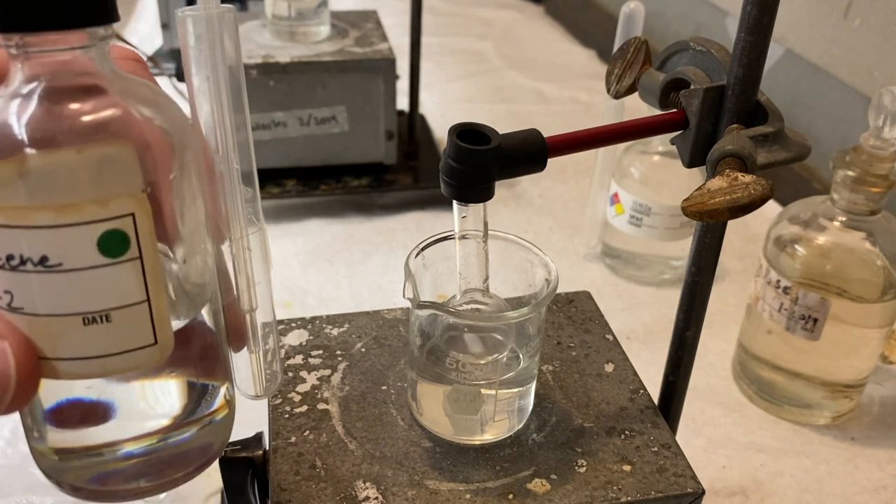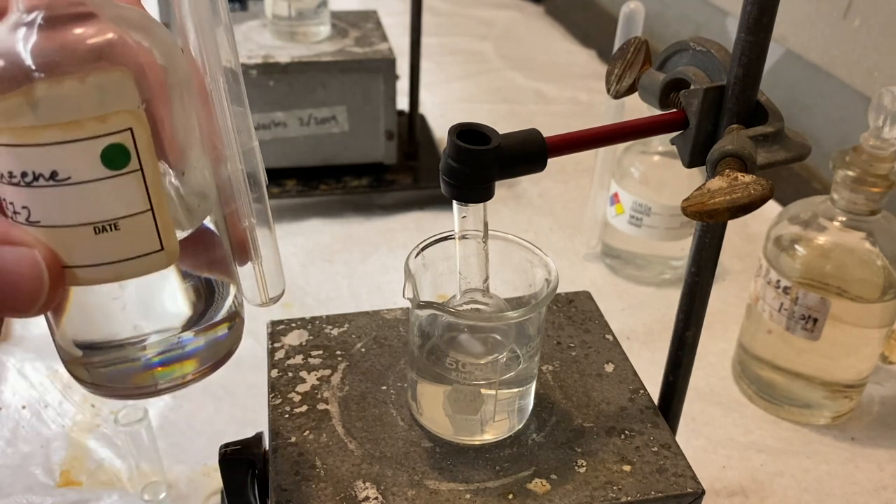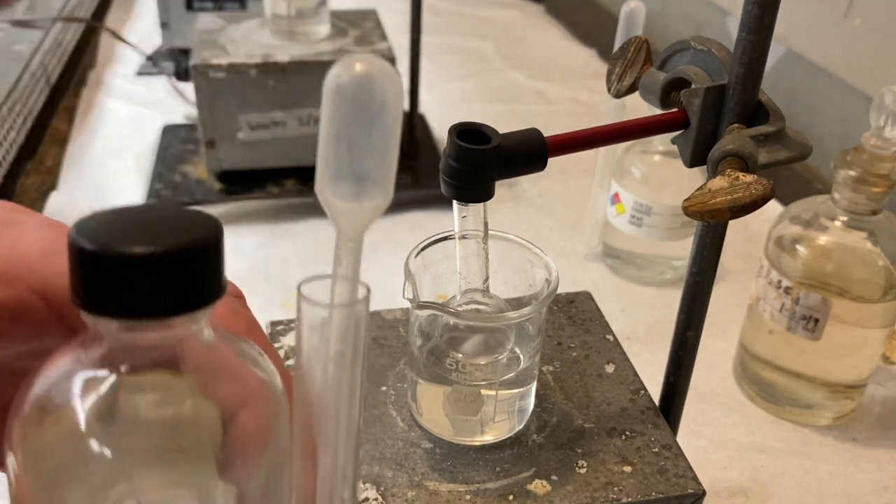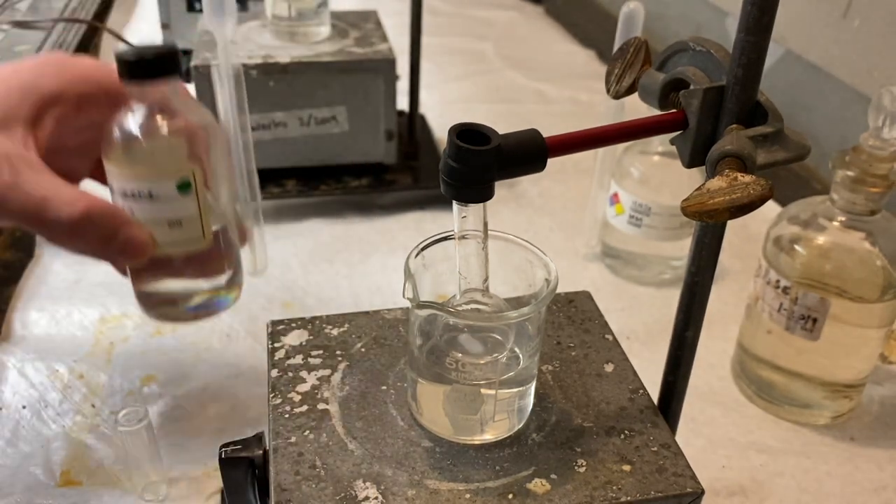About one drop every five seconds. We're going to add it half a milliliter at a time. So we'll just use our little dropper here and do that.